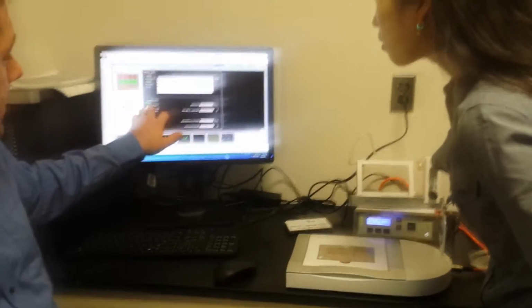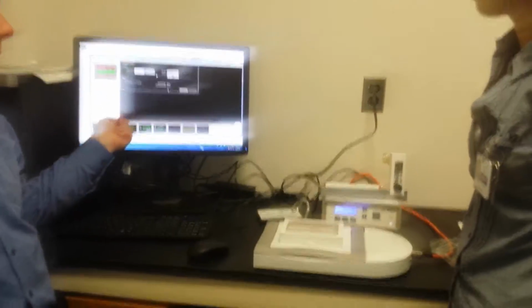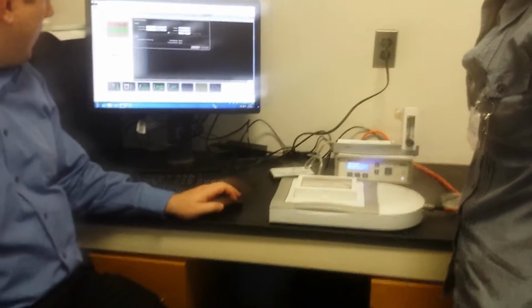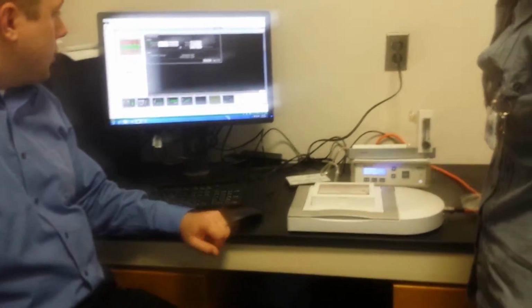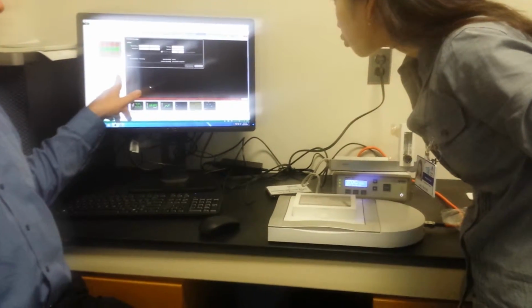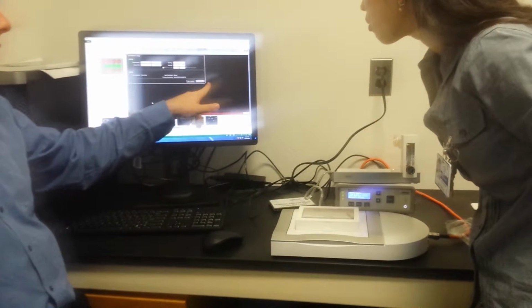So how we record? All right, first we need to make sure that it's recording. You want to always record from a running start, because every time you hit stop, that voltage offset is going to redo when you first hit it. So go ahead and hit start schedule. My options were either manually do it here or start it here. So if I start it there, stop it here, start it here, stop it there.